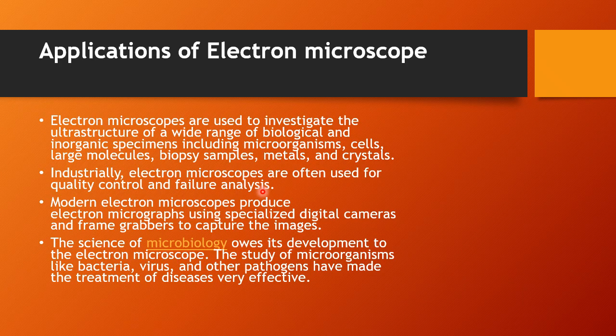In industries we also use the electron microscope for quality control and failure analysis. Today the electron microscopes we are using are very specialized. They can also produce electron micrographs by using digital cameras. We also use it in the field of microbiology. The microscope has given a very good understanding of bacteria, viruses, and other pathogens in causing diseases. And because of it, we have very good and effective treatments for diseases.